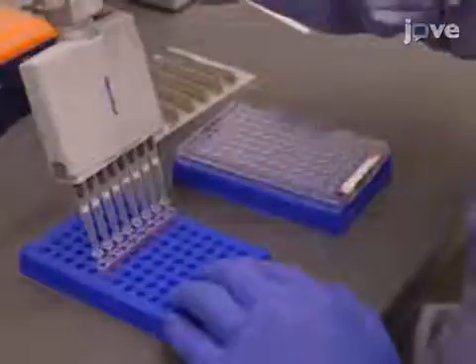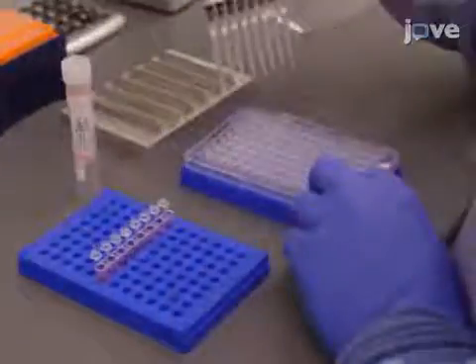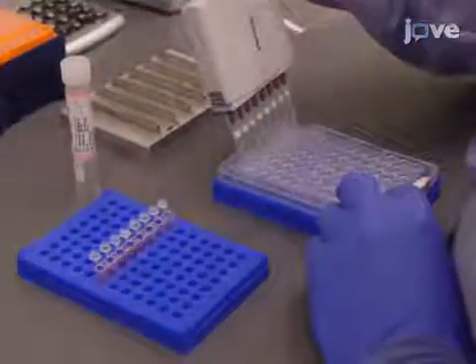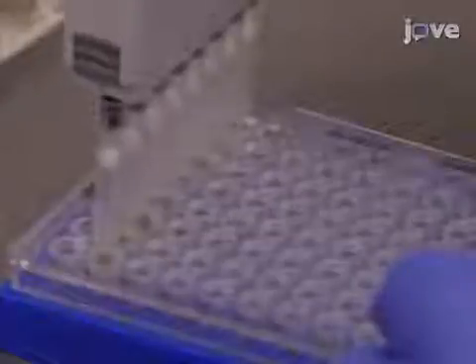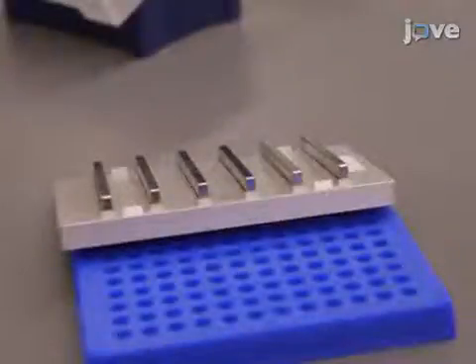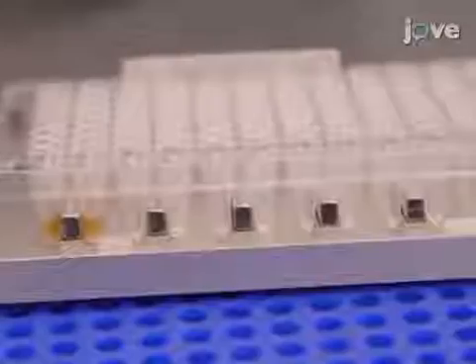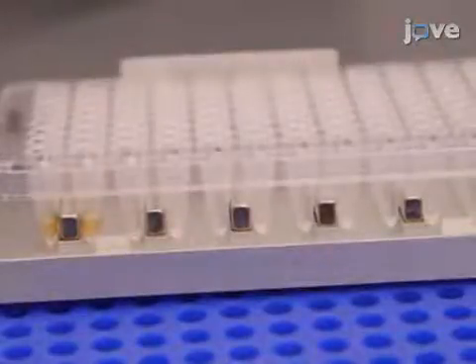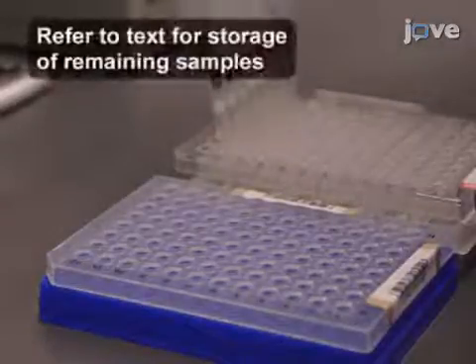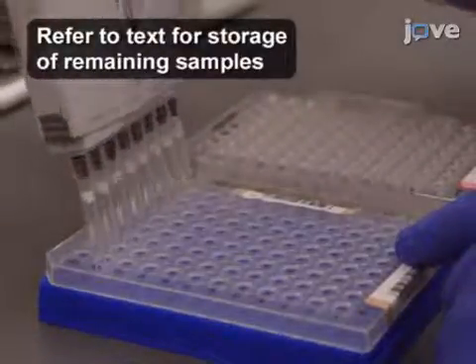After verifying the library yield and incubating the samples with magnetic purification beads according to the text protocol, add 30 microliters of EBT to each well of washed beads. Pipette up and down a few times to ensure the beads come off the side of the tube. Once the plate has been incubated with and then without shaking, place the plate on the magnetic stand and transfer 20 microliters of the supernatant to a new plate called the library normalization plate, or LNP.